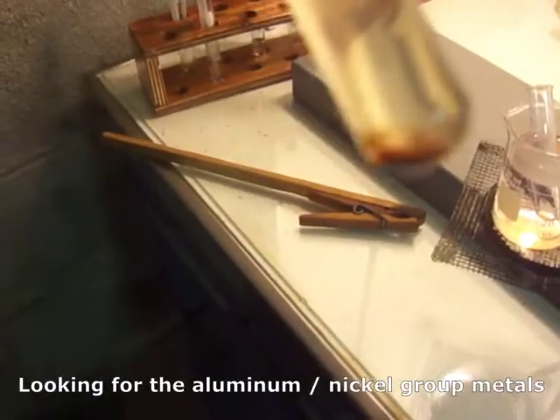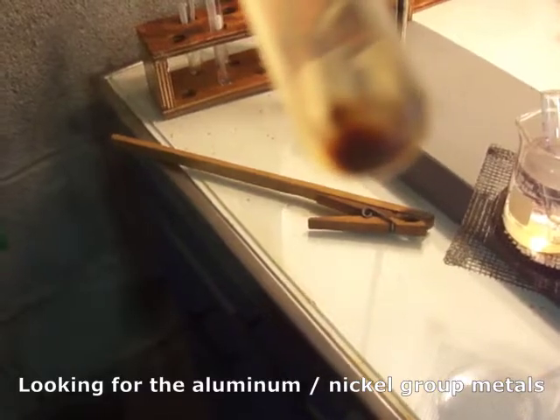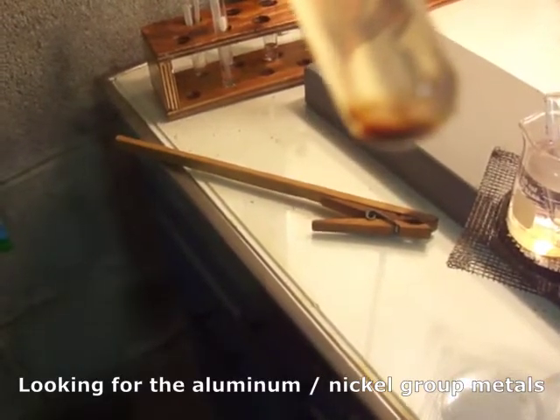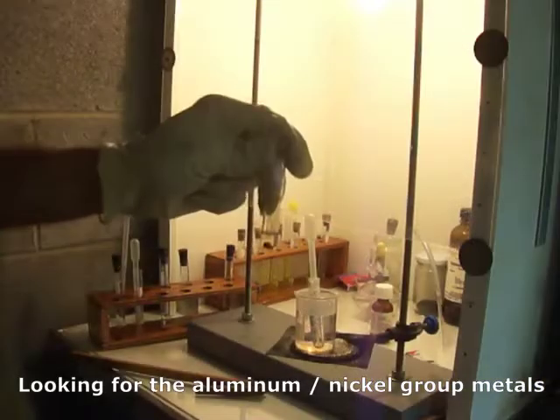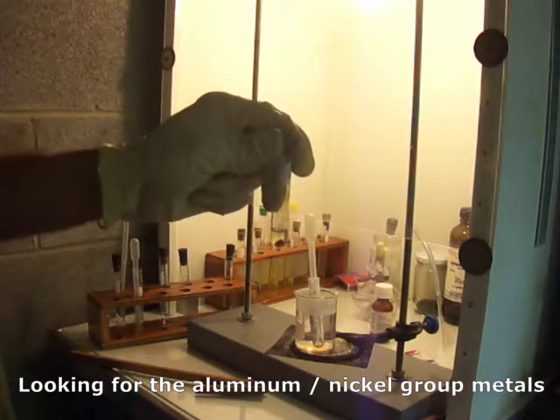Now that looks pretty brown. Supposedly if it's a manganese material, it should be more peachy colored, and iron is browns. Now we wash the precipitate in hot ammonium acetate solution.